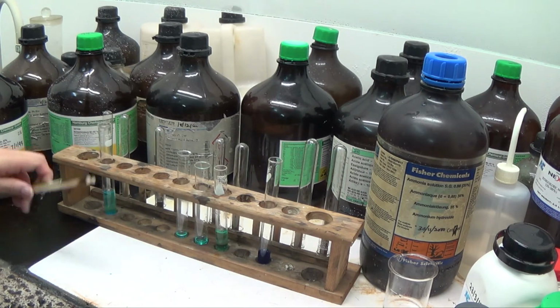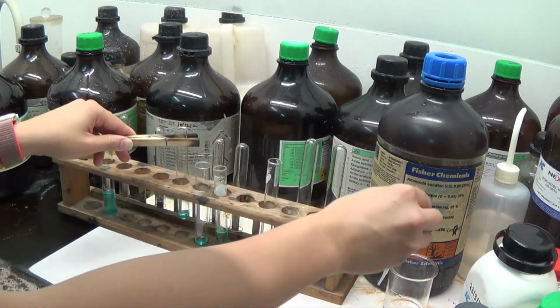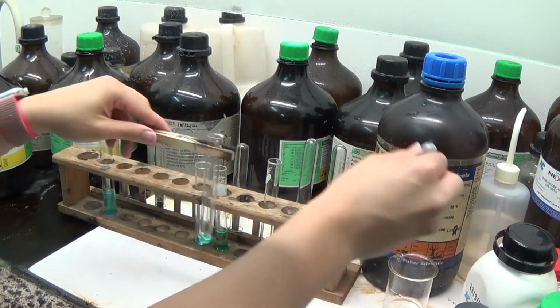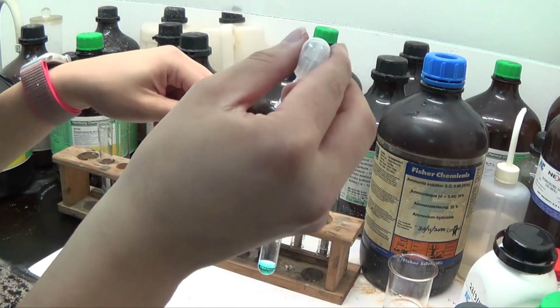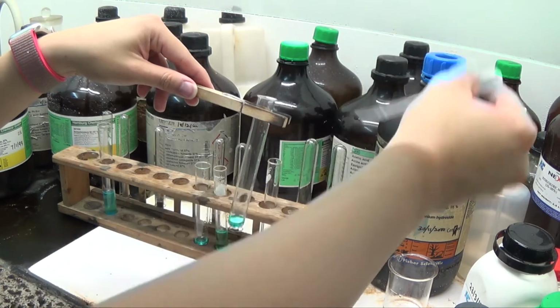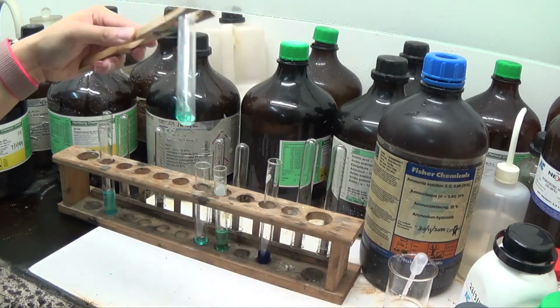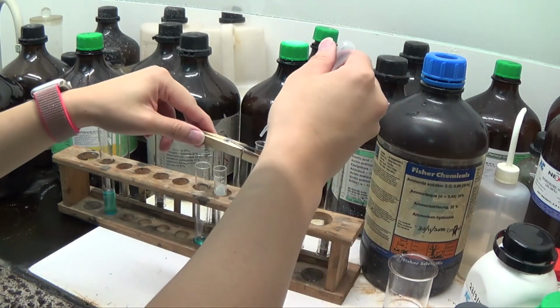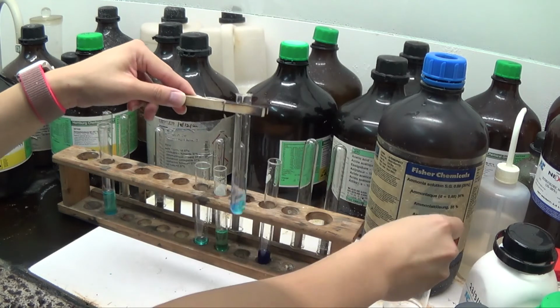I think I'll just show you what happened when I add just one tiny drop into it. You'll be given dilute ammonia for Q&A.